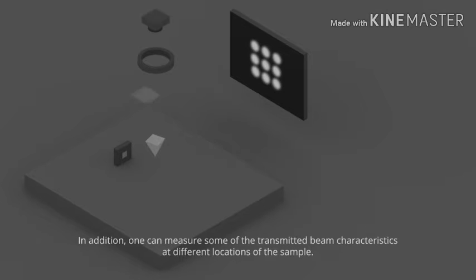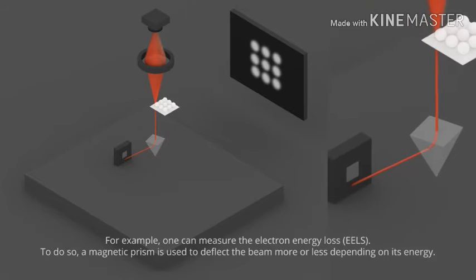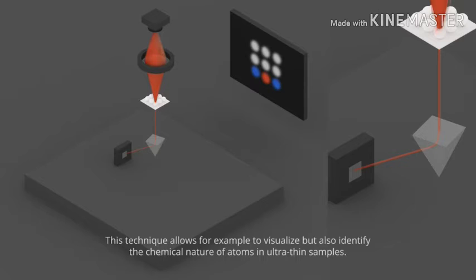In addition, one can measure some of the transmitted beam characteristics at different locations of the sample. For example, one can measure the electron energy loss. To do so, a magnetic prism is used to deflect the beam more or less depending on its energy. The more the beam loses energy, the more it deflects. The measure of this deflection allows characterizing different parts of the sample. This technique allows, for example, visualizing but also identifying the chemical nature of atoms in an ultra-thin sample.